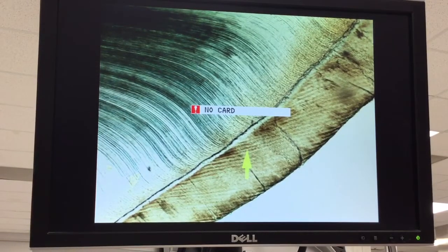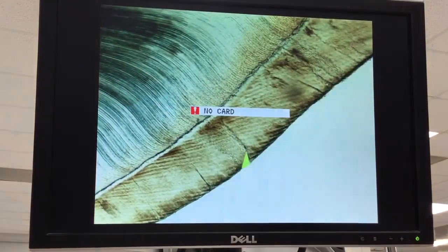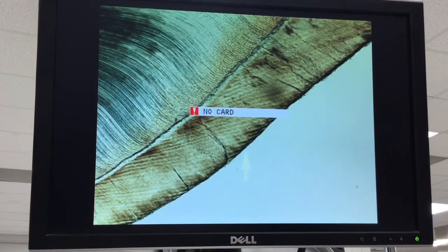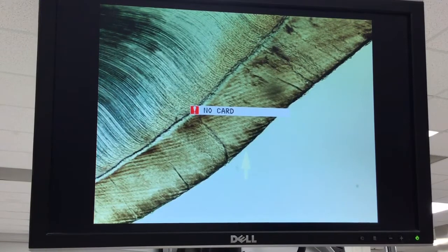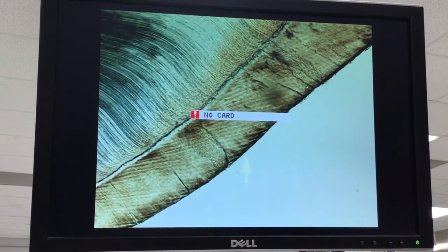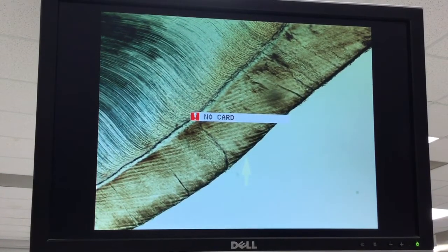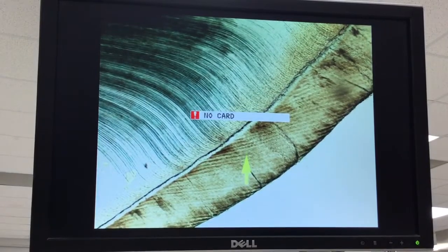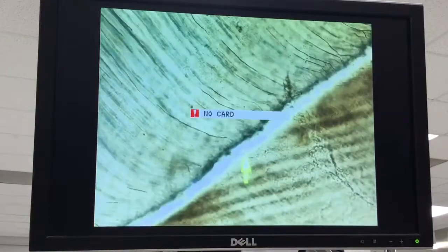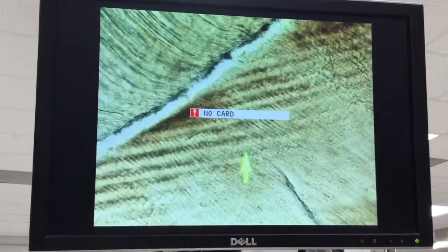They're going off at kind of an angle, and as they come up to the surface of the enamel, they would form the perikymata. We can see those lines of Retzius, and as we go up in magnification, these lines going more or less in this direction are the enamel rods. So they bisect or are bisected by those lines of Retzius. And down here we have the DEJ.